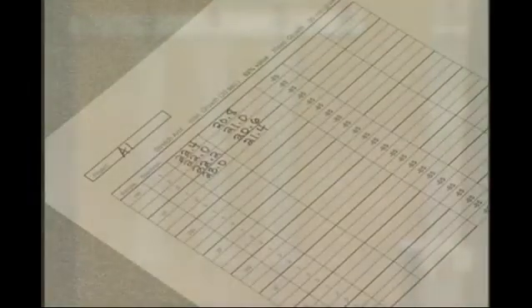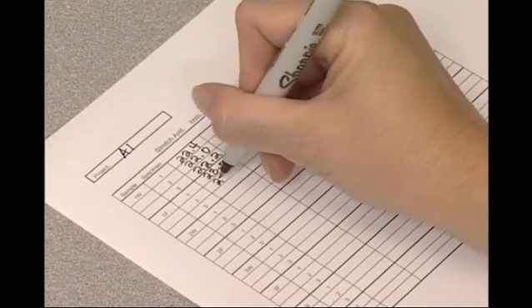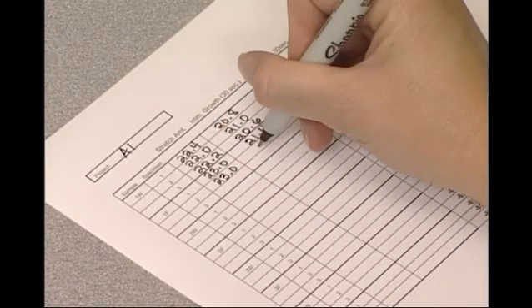The formula for calculating percent growth after tension is to subtract the original benchmark distance from the distance measured at the 30-second, as well as 30-minute, 1 hour, and 2 hour intervals, then divide by the original distance and multiply the resultant number by 100. Test data for stretch and growth percentages are reported as average length and width to the nearest tenth of the percent.